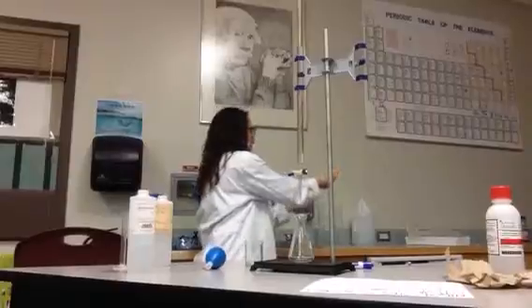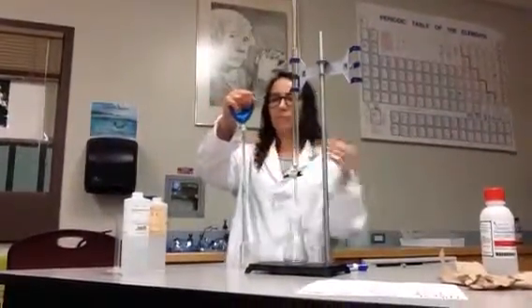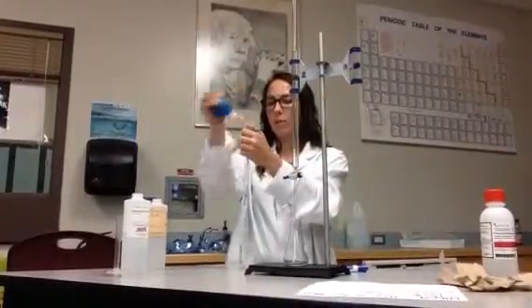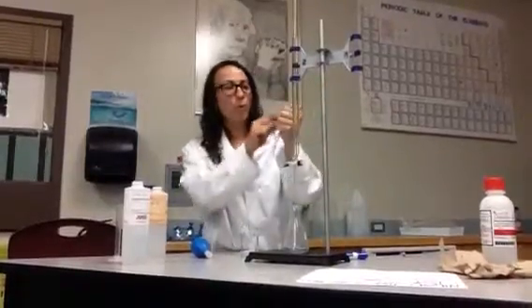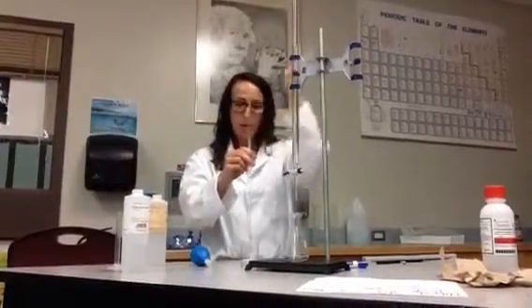Okay, and once again, I'm going to go like this. Oh, I forgot to show you. Just a minute. I'll show you what I just did. When you're sucking this up, have you ever had some pop or iced tea where you put your straw in, lift it up, and then drink it out of the bottom of the straw? You know what I'm talking about? That pressure that you keep when your thumb is on the top, I'm using the exact same principle here. If my thumb is at the top, that liquid will stay in my straw, and as soon as my thumb is gone, the liquid comes out. Do you see that?